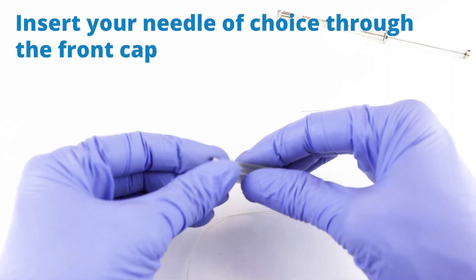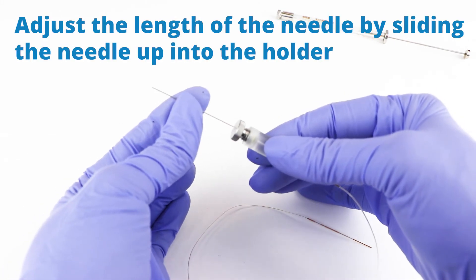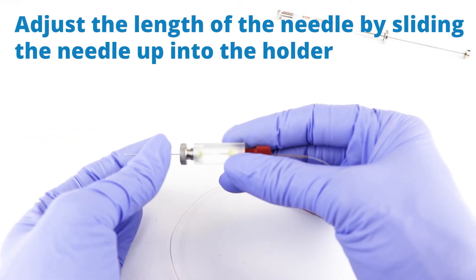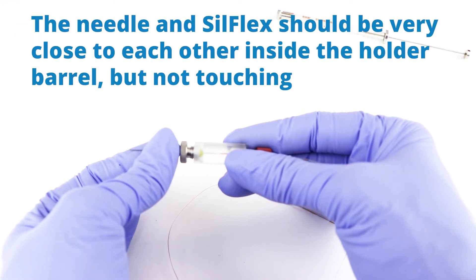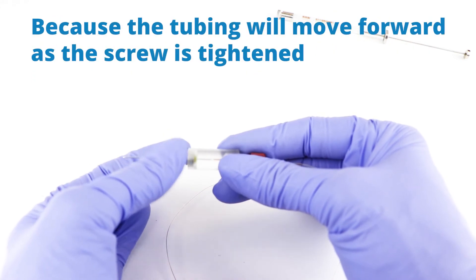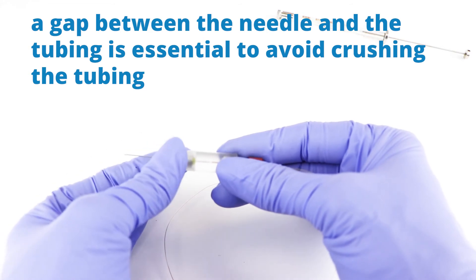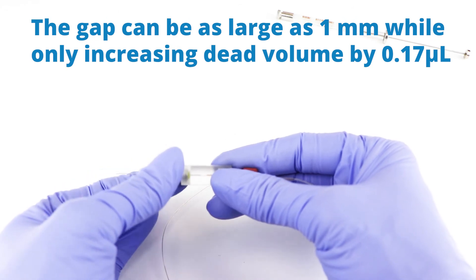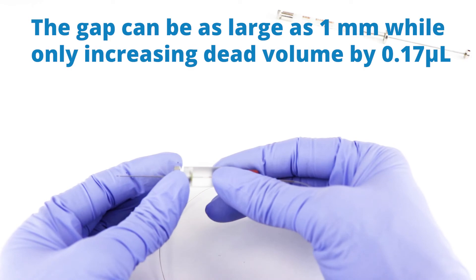Now on the other end, I loosen up this nut and install the needle right here. You can see the needle inside there — they should almost touch. The needle and the Silflex should be very close to each other inside the holder barrel, but not touching, because the tubing will move forward as the screw is tightened. A gap between the needle and the tubing is essential to avoid crushing the tubing. The gap can be as large as one millimeter while only increasing the dead volume by 0.17 microliters.